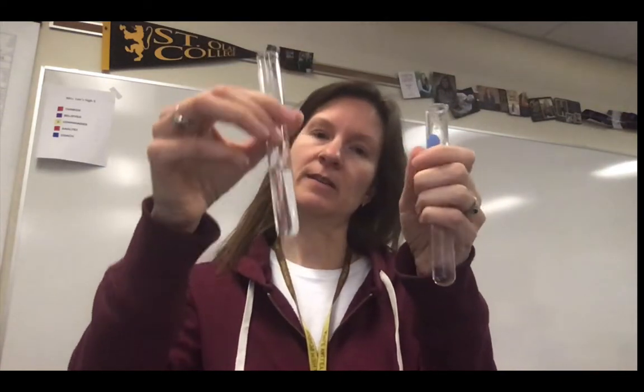In one test tube, I have the 10 mLs of HCl, and in it I'm going to put 0.12 grams of Mg. And then in the other one, I have the 10 mLs, and in this one I'm going to put 0.41 grams of Mg. So varying amounts of Mg in order to see the limiting reactant situation.